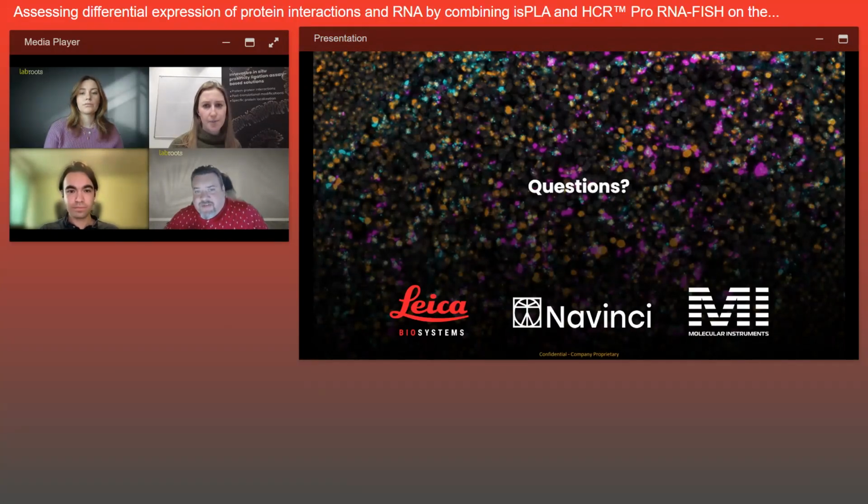Don't know who would like to take that one. Maybe they meant isPLA. Let's assume that they meant isPLA on the integration. Yeah, so it's really just a few bond wash steps, nothing particularly special. And then there is a step there to remove the HRP that we've used to detect the isPLA signal with. And then we really just jump straight into the beginning of the HCR Pro RNA fish protocol. That's really it. Okay.